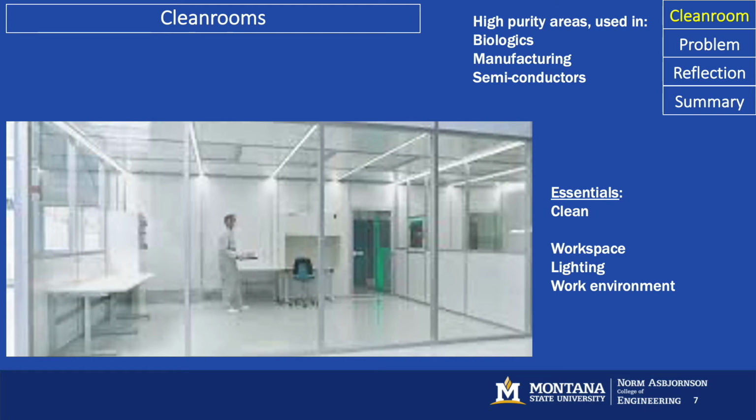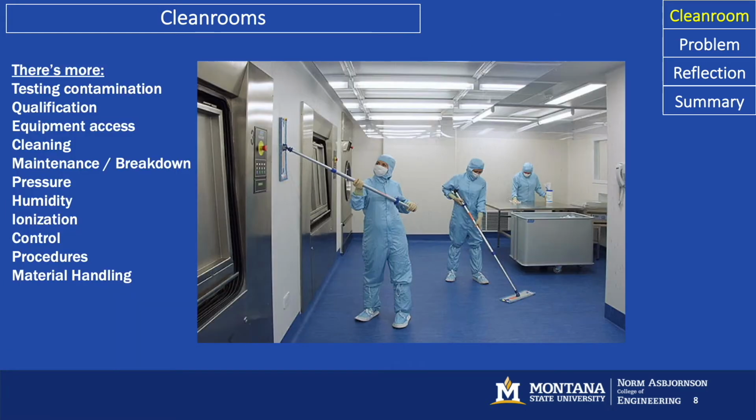So our main overview video on cleanrooms identified four critical areas that cleanroom design had to focus on. And these truly are the central aspect of cleanroom design. But it's way more complicated than that in real life.